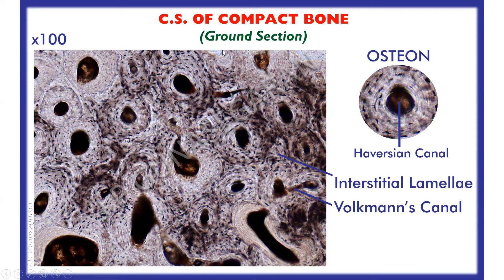This is a ground section of compact bone cut crosswise. Ground section means a small piece of dry compact bone is taken and rubbed against a rough surface to make it as thin as possible and examined under a microscope. It is an unstained section. During this dry processing, soft tissues are destroyed, leaving behind the complex communicating canals and canaliculi.